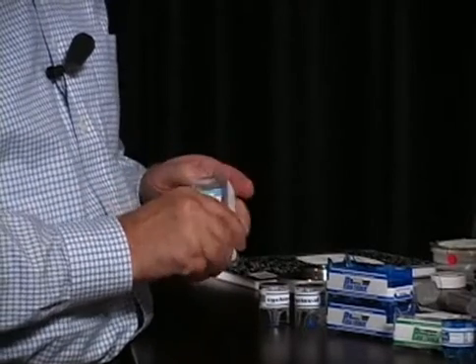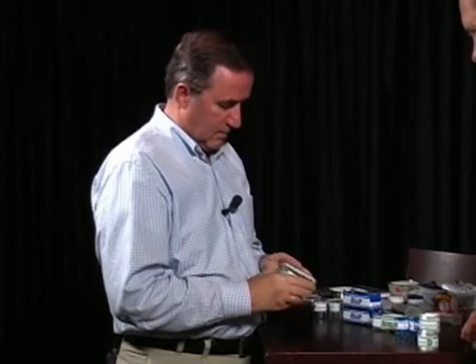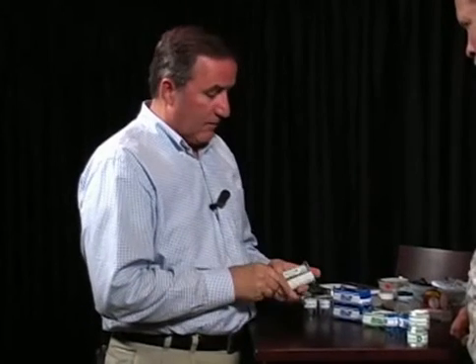So you can put it up to your barcode reader, get it uniquely identified, look on the chain of custody, verify that this is indeed the sample that corresponds to the chain of custody, and it just saves a lot of time. It also, of course, makes it so that the lab, when they open up cassettes, has to relabel the slide. With the barcode, you don't have to relabel the slide, so it saves a step.